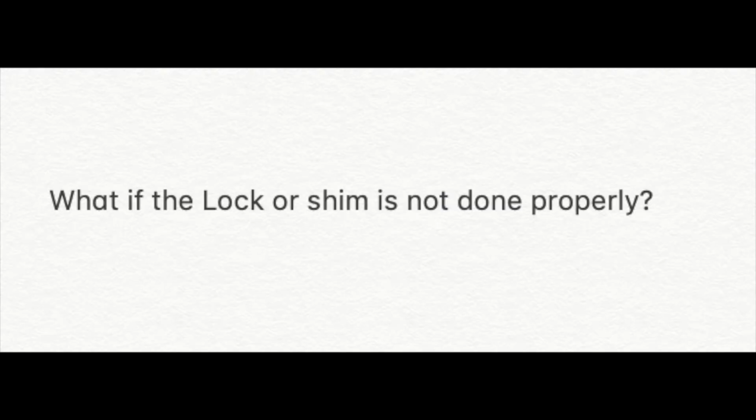There are a few things that can happen if you don't lock or shim the instrument properly. One thing is that you just won't get a spectra. There will be an error and you have to restart the experiment. The second, the spectra will have a lot of noise if it's not set at the right levels, and that'll be hard to read. You might not get the right integration, and it'll be hard to know what you really have. The third is you will get a spectra, but the chemical shifts can be skewed if you didn't lock it correctly or you didn't lock it with the correct deuterated solvent. And lastly, you can damage the machine. You definitely want to lock and shim properly so you don't break anything within the instrument.